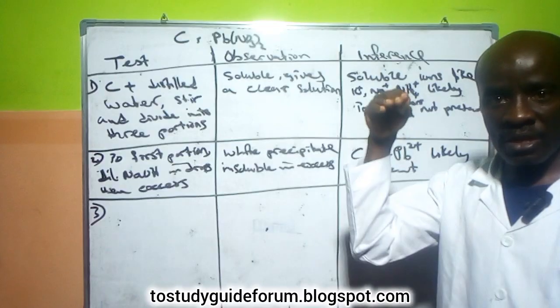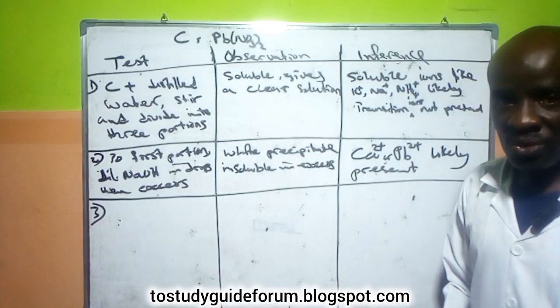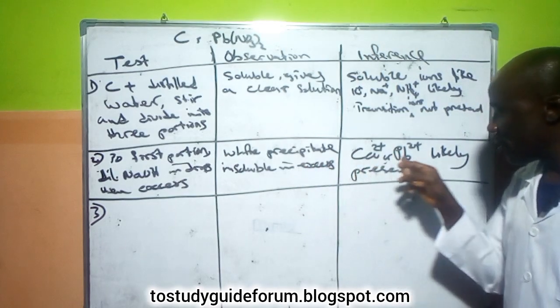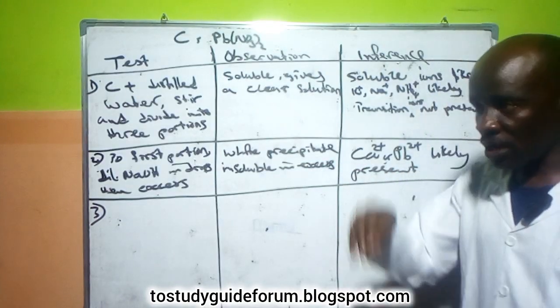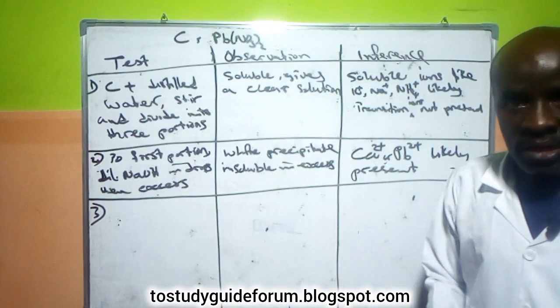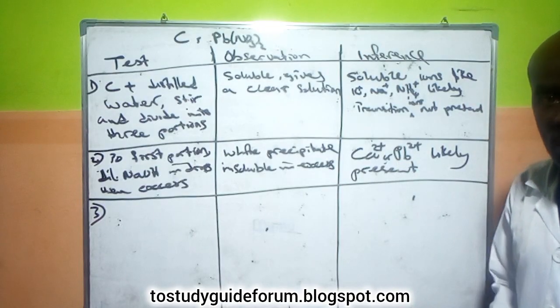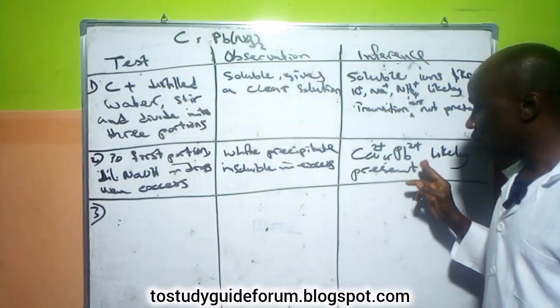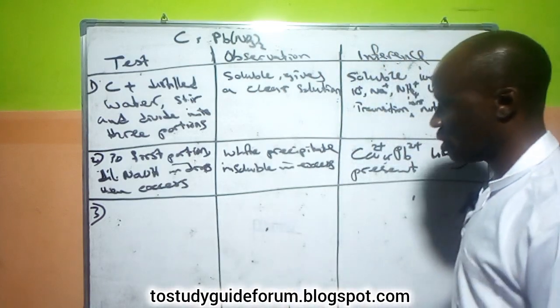After a while, all of it will gradually go down, meaning that it's not a gelatinous precipitate. So what we have with lead and sodium hydroxide is always a white precipitate. The cloud will form at the top and gradually go down and then mix up. You have a white cloudy precipitate in there. So we should know this.